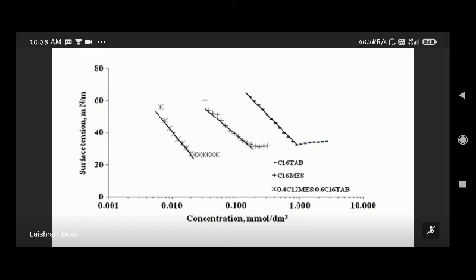First you will start with distilled water. Then you will start with the most dilute detergent solution, and find its time of flow. The same thing you did: take 3-4 readings and count the number of drops, right? You should get almost 3 constant number of drop readings for one concentration of detergent solution.